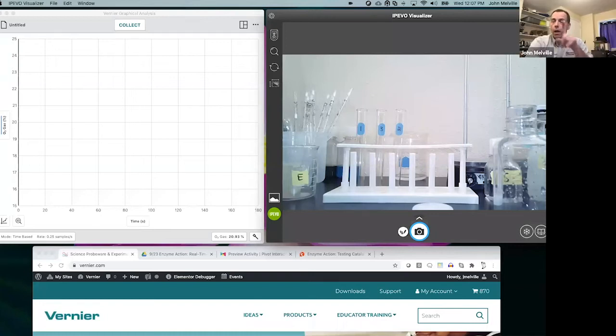Okay, great. One thing that I wanted to talk about is what to use as an enzyme source. The other reason why I think it's a great activity is that you could easily do it at home or in your office, like I am right now at home, with your students on a Zoom call. You could do the entire experiment like I am. You could show it to them. They could see it really happening. It's also so simple because all that you need is water, hydrogen peroxide, which you can buy at any store, 3% hydrogen peroxide. And you can use yeast as an enzyme source that students could actually do themselves if they had the equipment.